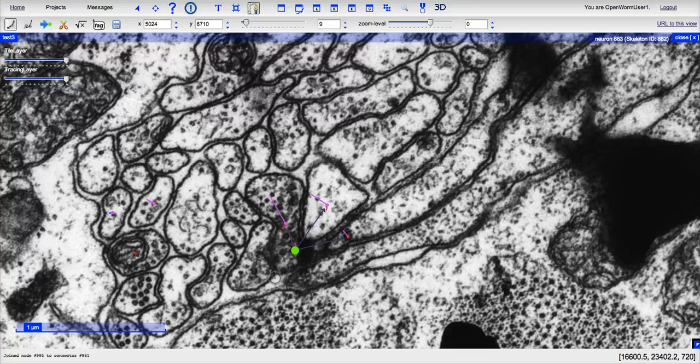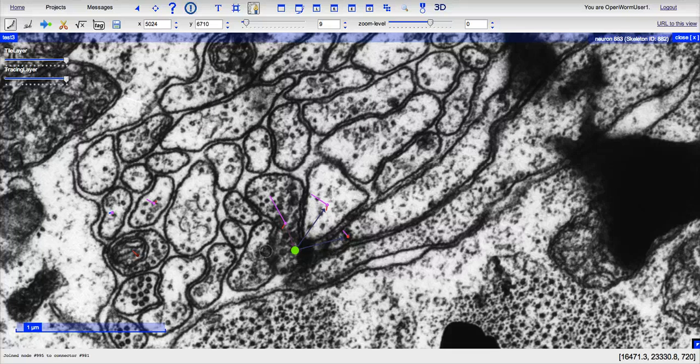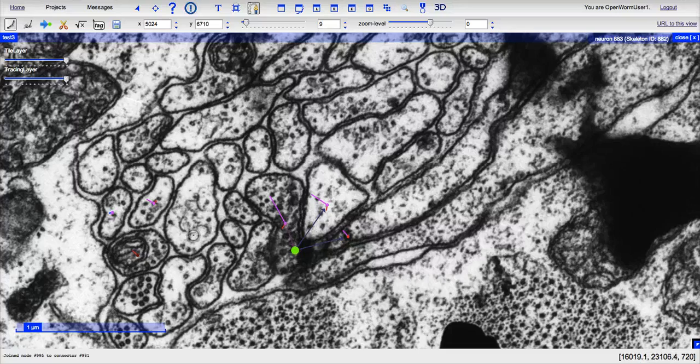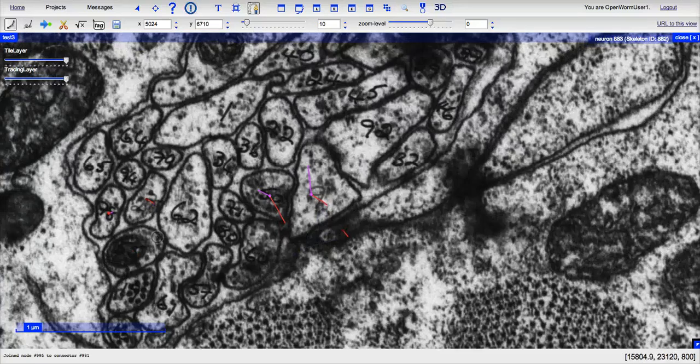Once you're done, you can hit shift, and you have marked your synapse. You can see your presynaptic cell and your two postsynaptic cells.